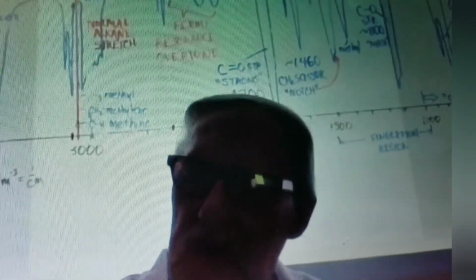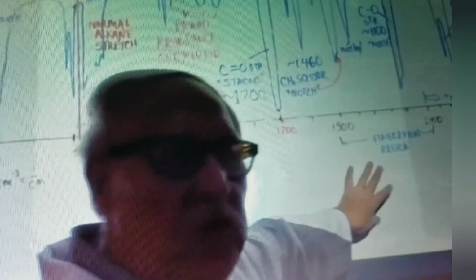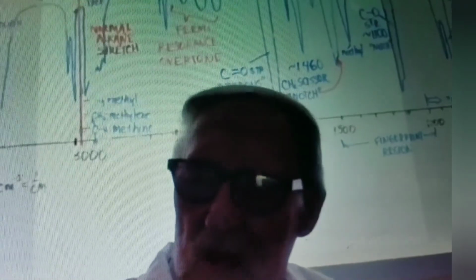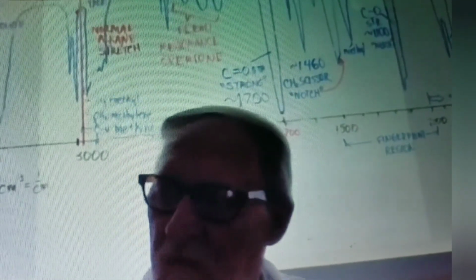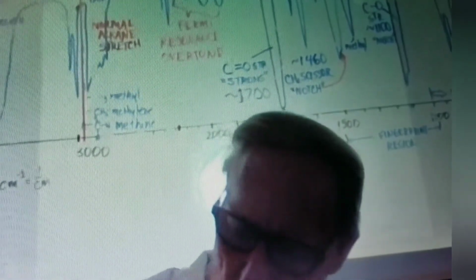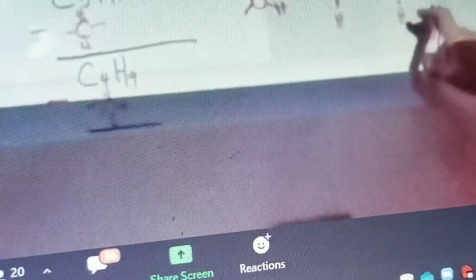Okay, now I want you to have access to this page you just put in your notes, and now I'm going to show you how to use this. I'm going to try to do two examples real fast and show you how that works. We got it right. See how important it is? Just one little H can throw you off. Put these four pieces together, guys. There's only one or two ways you can do that.